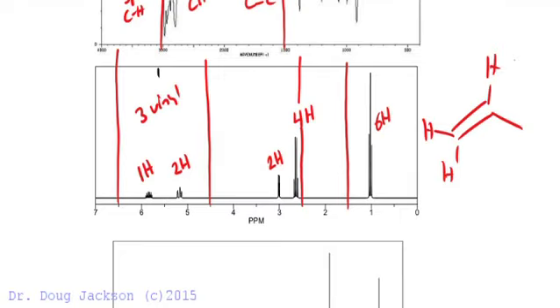Okay, and so what the integrations are, we really don't know. They're all multiplets because they have diastereotopic neighbors. So I'm not going to try to assign one or the other, A, B, C, D, and E. These signals are all 3 different, so really we have overlapping signals here anyway. Okay, so we've probably got D, E, and F here. They're in the same place though, so it's really hard to assign, but among these 3, we know we've got D, E, and F.